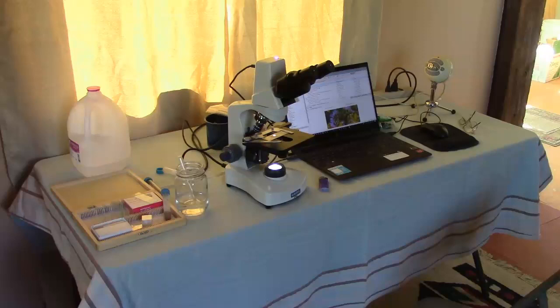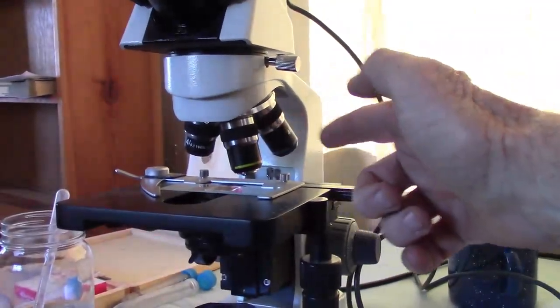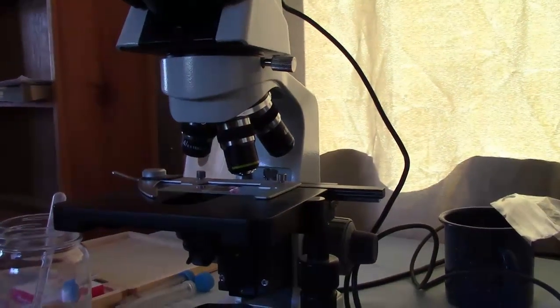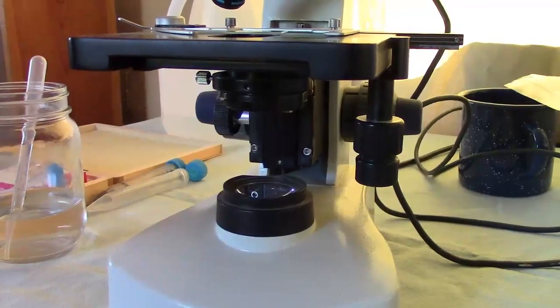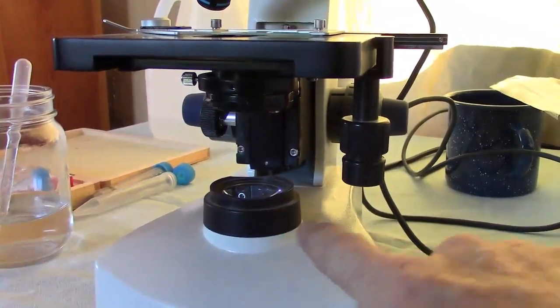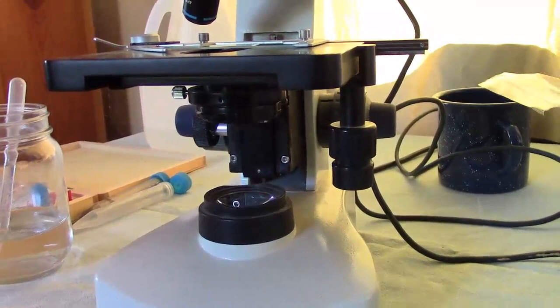To begin with, you'll need a good microscope. Your requirements include lenses that have 440x total magnification. If you look on the video here, you'll see that the lenses are marked 4 and 40. You've got to take into account the eyepiece lenses, which are 10x, so the total magnification is 40 and 400. Your microscope will also need an iris diaphragm and an Abbe condenser. These are extremely important for you to be able to see the soil life, because a lot of that soil life is clear, so you'll need shadowing in order to see them.